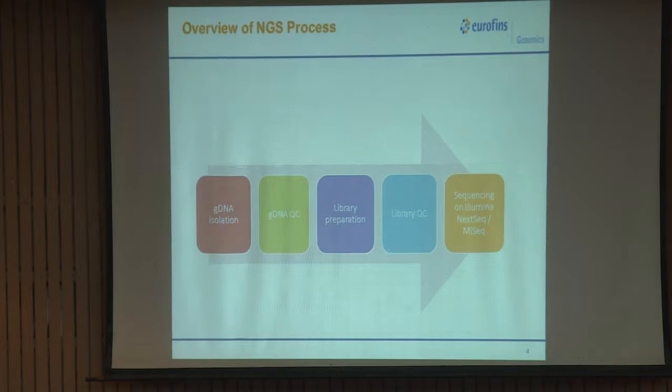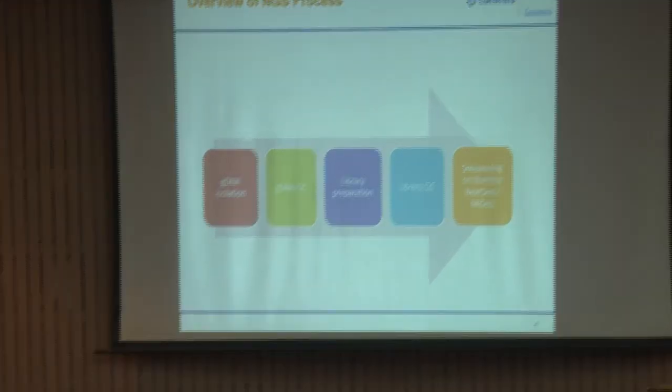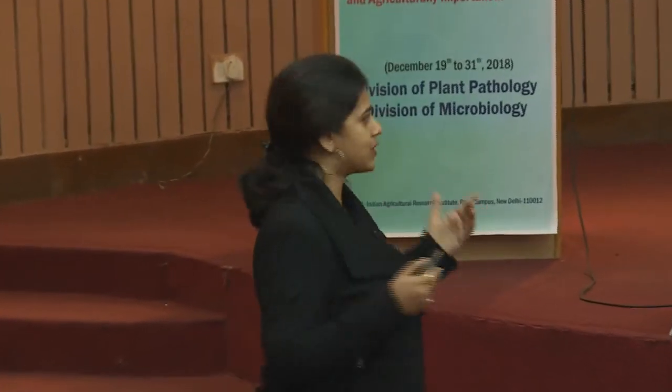So, these Illumina adapters, we will go into detail on how they bind and all. Those adapters attach to these DNA templates and the machine can identify that this DNA template needs to be sequenced with the help of those adapters. Those adapters are nothing but a primer set, similar to a primer set which has a copy in the machine as well. So, it binds and then the DNA template gets sequenced, right. So, that is how the DNA template is getting sequenced. That is what is called library preparation.